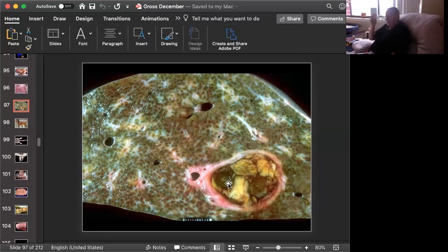And if you ever, when you were a kid, ate something that we called sugar babies, they're little caramels, and they're small, they were round, and that's sort of what these remind me of. A lot of young residents, when they first see gallstones, miss them because they're expecting something hard and white, like you would see like struvite stones in the bladder, and they're not. They're often very mushy, and they're sort of a dark brown. And then there is a second type where you do have a higher amount of mineral in them. They tend to be whiter. It looks like this particular animal was producing both of them.